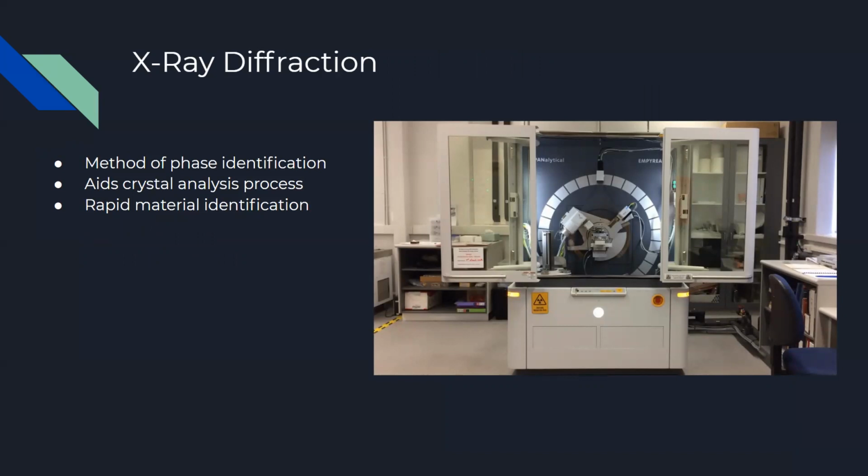Now, X-ray diffraction plays a valuable role in making sure that additive manufacturing can be optimized for part quality. Typically, X-ray diffraction is used to identify the phase of a material by mapping the intensity of a received ray of X-rays from the incident X-ray. The angle is varied during the experiment, such that a plot of the Bragg angle and the received intensity can be made. This plot is known as the X-ray diffraction pattern, which is unique to any given compound. This helps scientists and engineers identify the sample substance, and it can even help to determine crystalline structures of the sample on the atomic level.